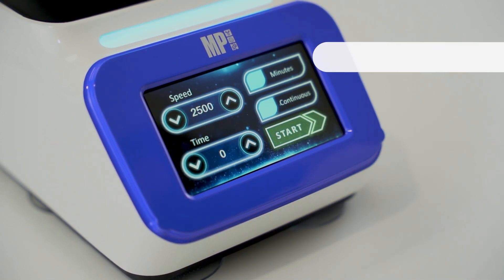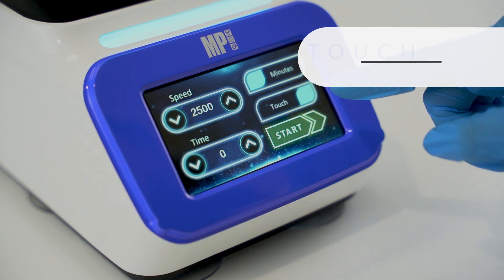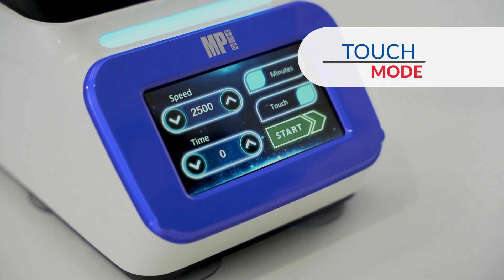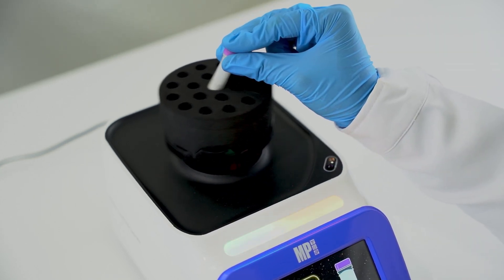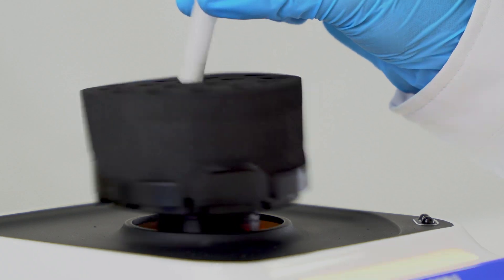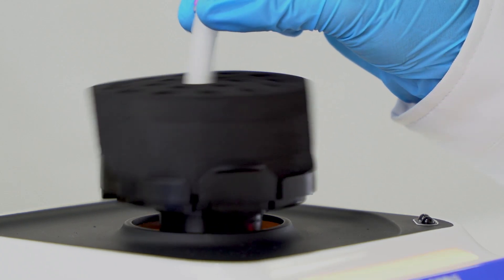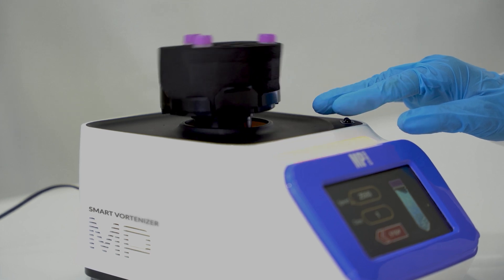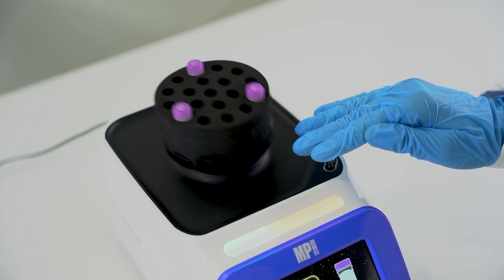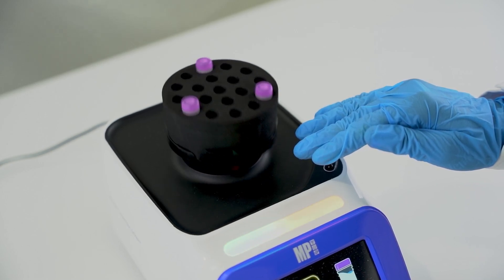By switching out from continuous mode, the Vortanizer enters touch mode. This mode activates the sensor at the top right of the machine, which will start the vortex operation upon sensing the user's hand hovering above the sensor. Unlike other brands of vortex which require the user to apply force on the platform pad, our sensor-activated vortex takes the stress away from your wrist.